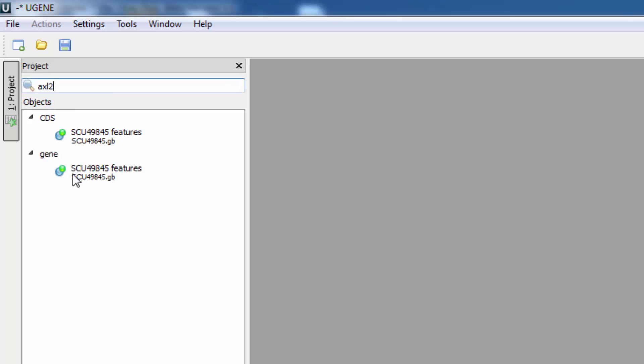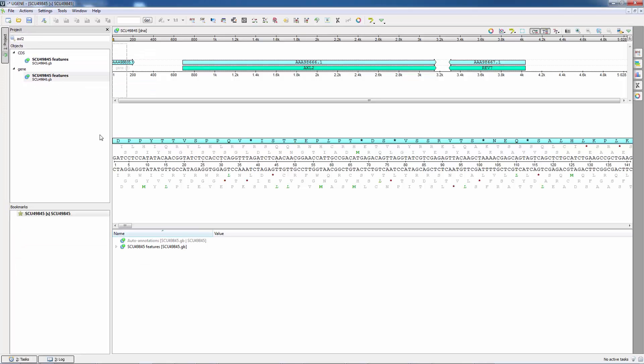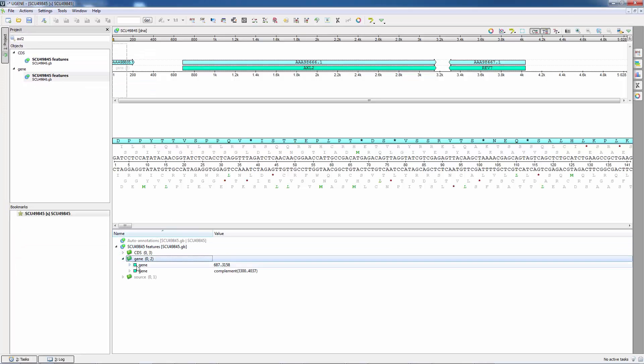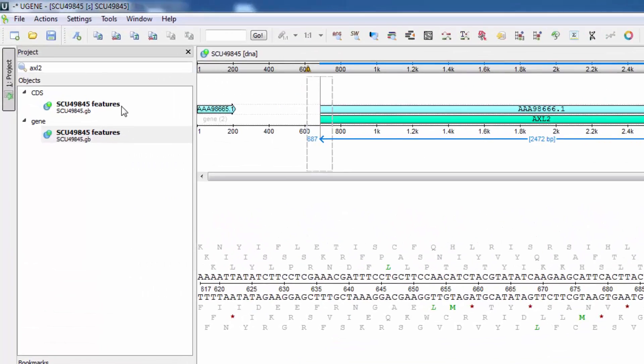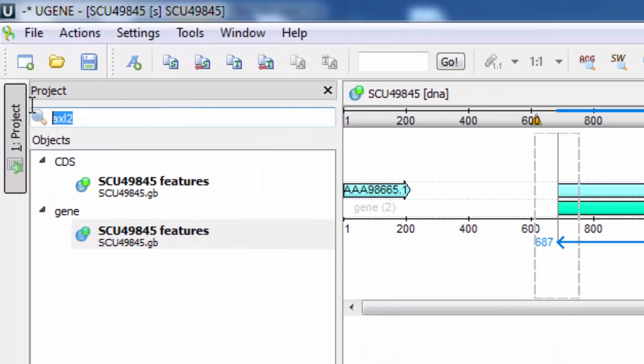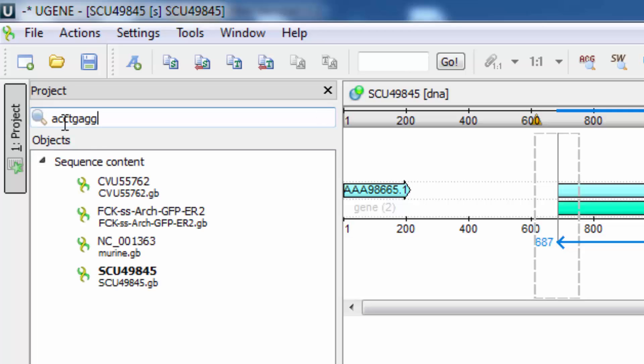For example, you can search for a sequence that contains a gene with a special name. Or, you can even write nucleotides that a sequence must contain.